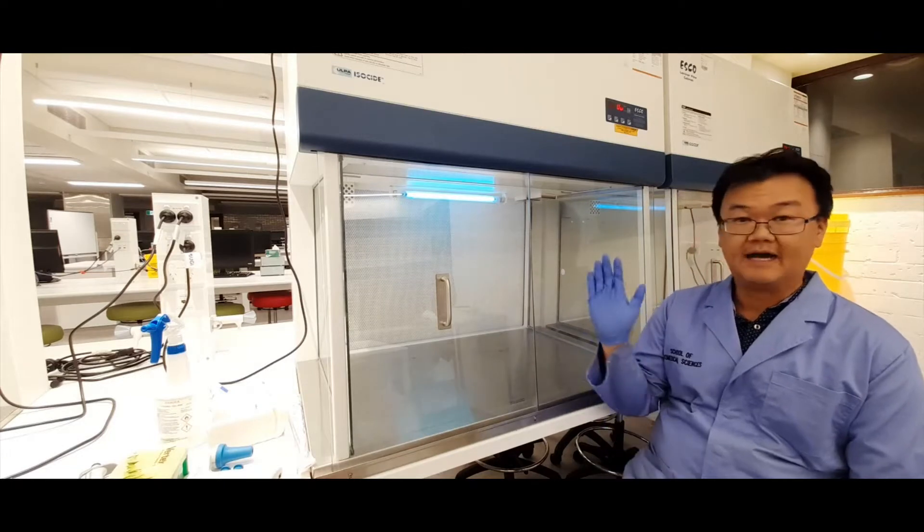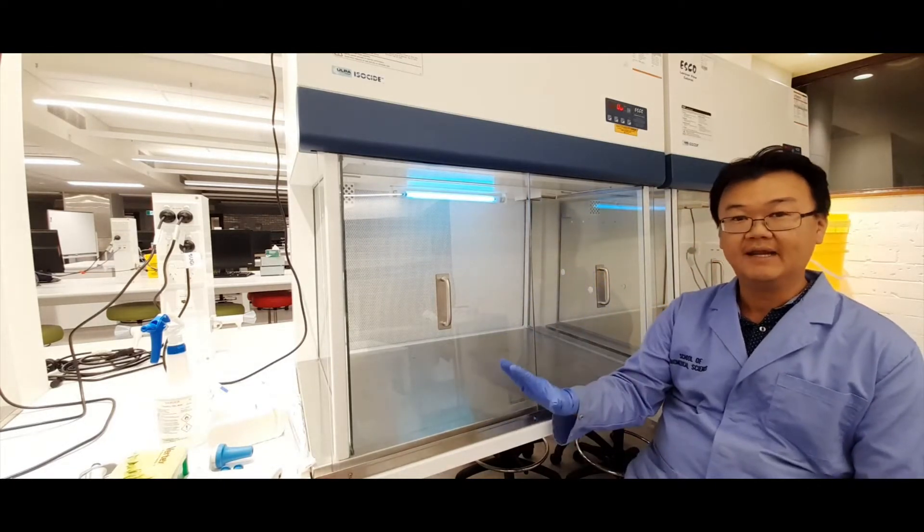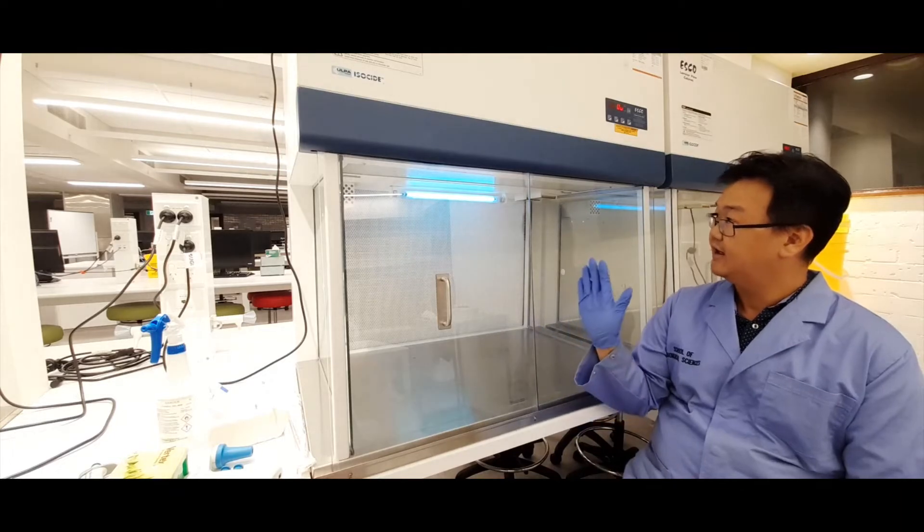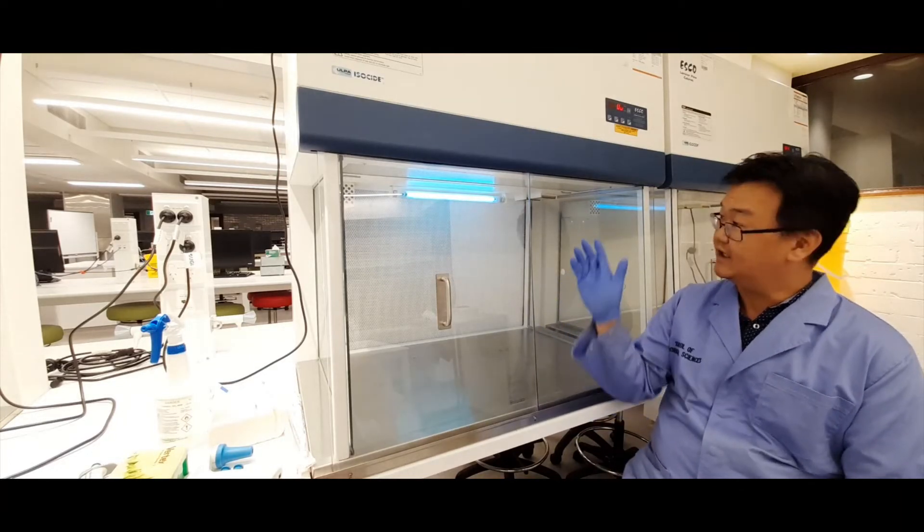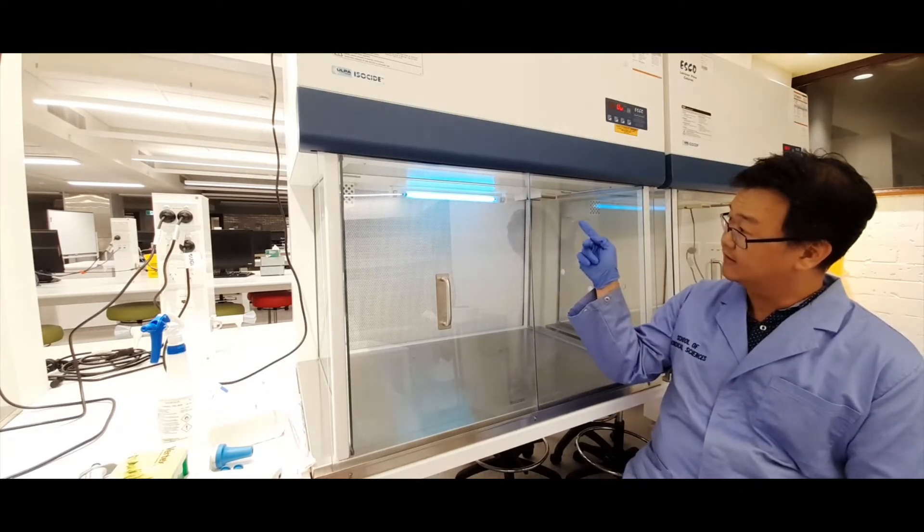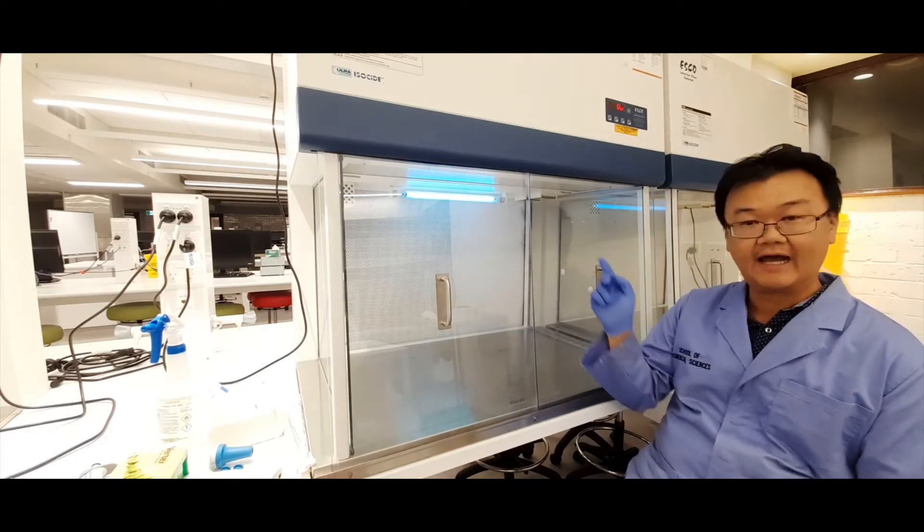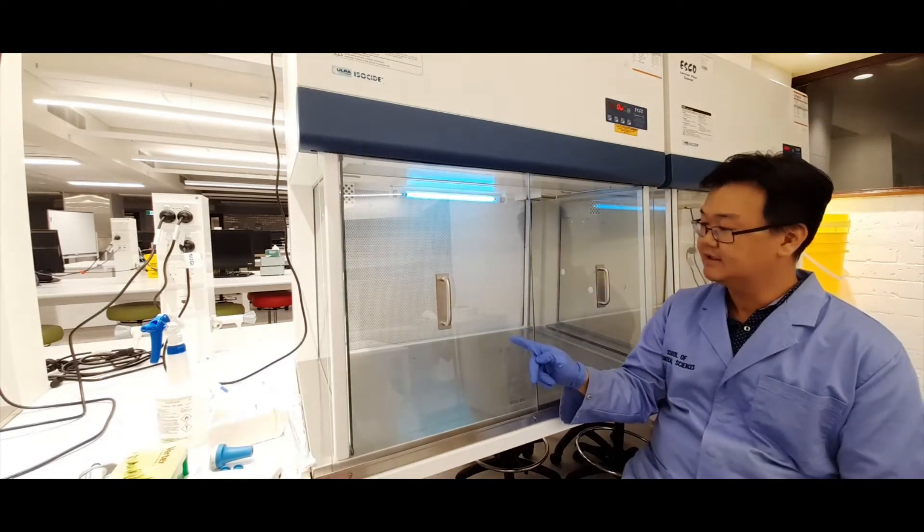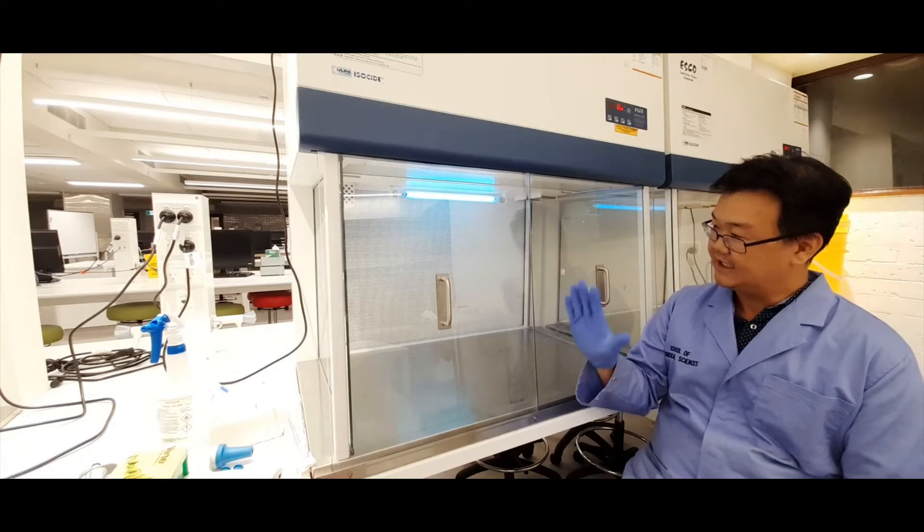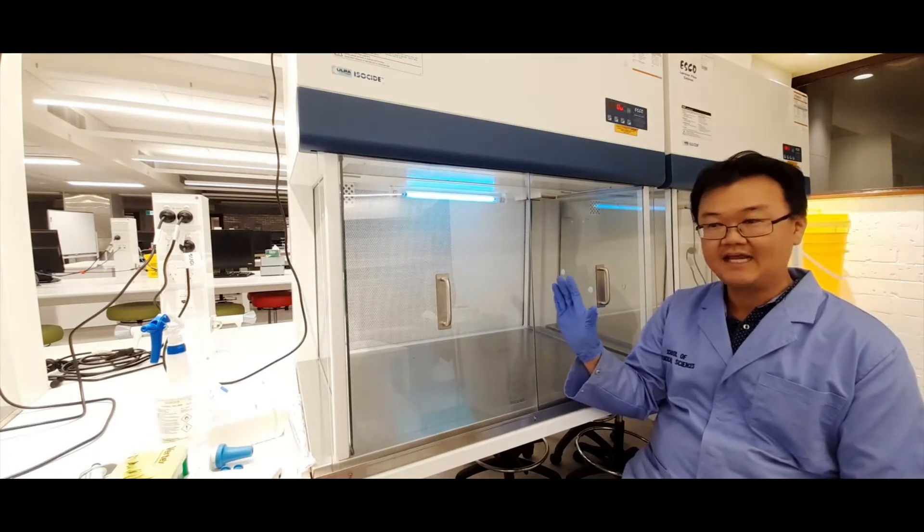These biosafety cabinets are a sterile working environment inside because they're irradiated with UV light. You can see the blue light on currently. It's basically sterilizing the inside of this chamber, and you need to work inside one of these biosafety cabinets when you do your cell culture.